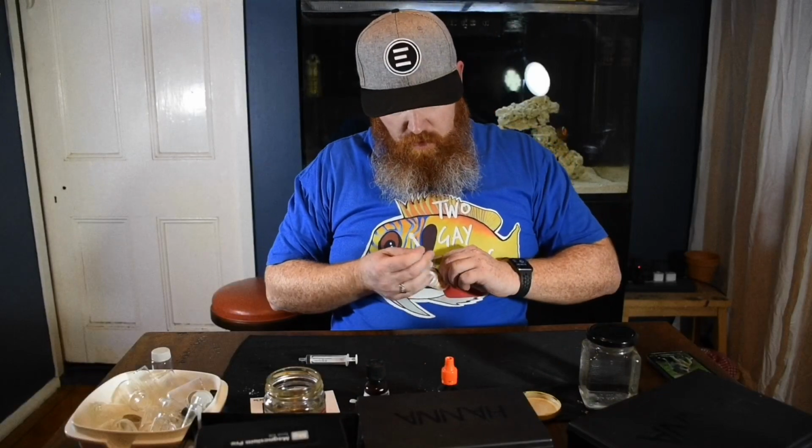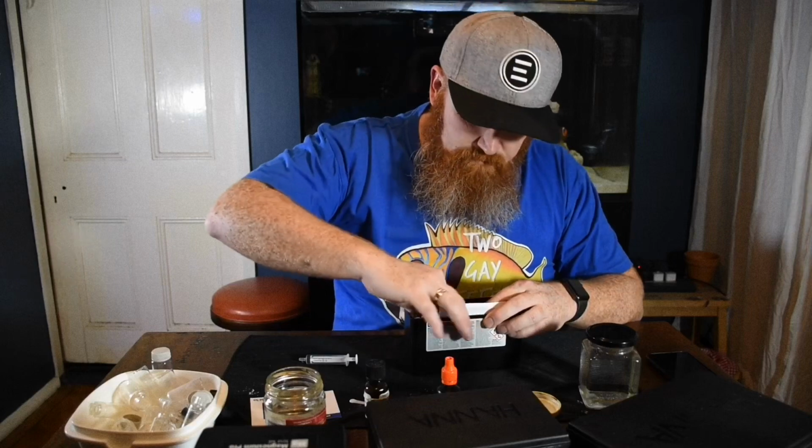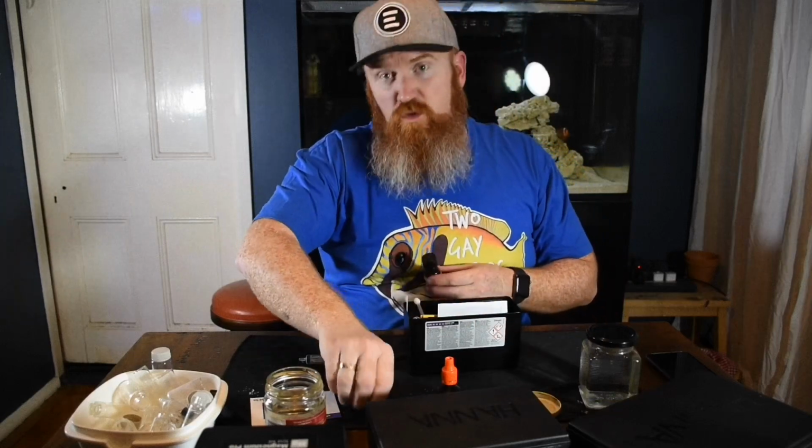Clean up as you go, I always find is the best thing to do, otherwise you end up with a big mess of stuff at the end of the day. Make sure your lids are all done up tight.